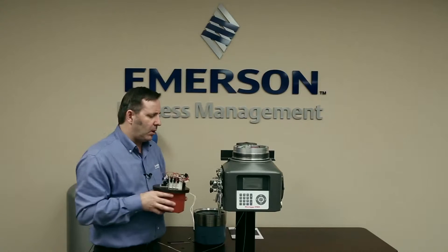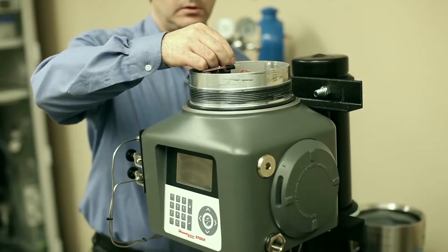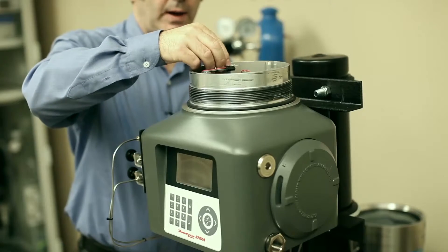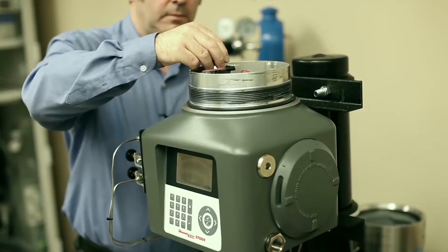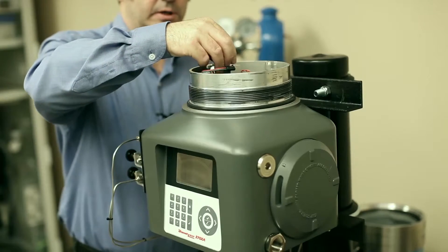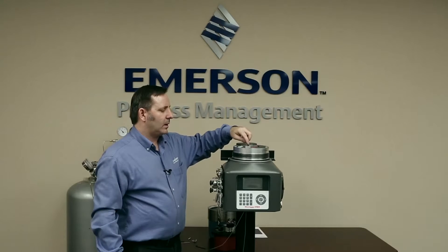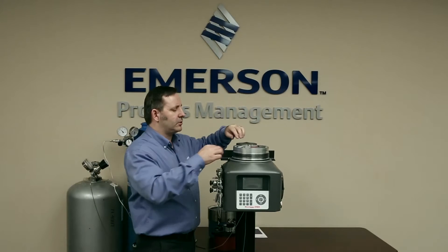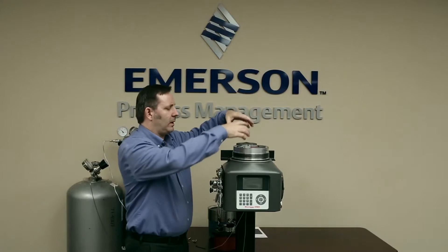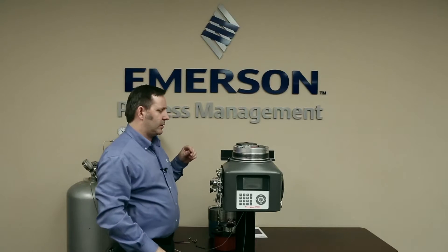So now we're going to put this new module onto the GC. The first thing to do is put the new O-rings into the feed-through. We always want to use new O-rings because we don't know how long the old ones have been in there — this ensures we always have a running GC once we're finished. Just before I put the new module on, I want to show you this feed-through — you can see it's on kind of like a spring. As we screw the module down, it pushes down onto this very strong spring and that gives us our tight seal on the O-rings.